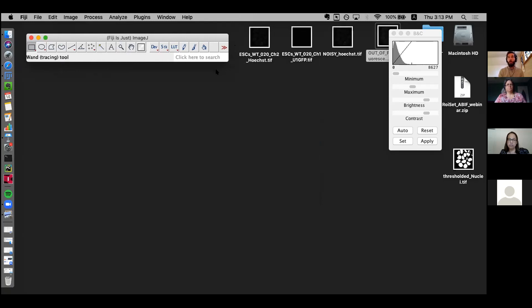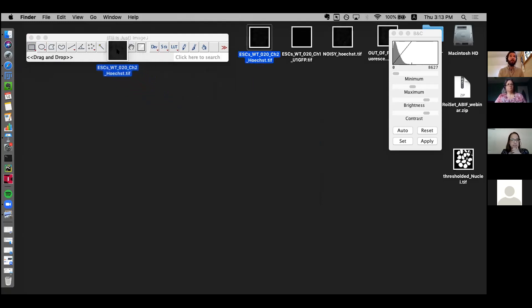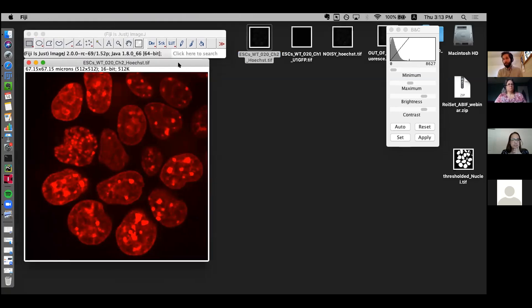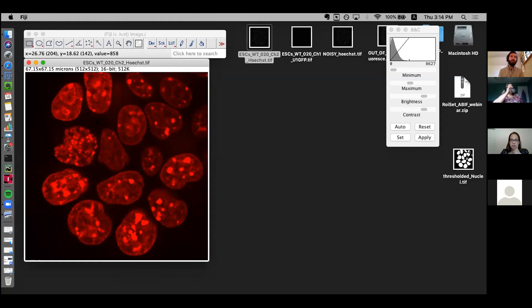We'll open one of our images — the Hoechst file, ending with 'hoechst.tiff', which is the DNA stain for the nuclei. You can just drag and drop it into the Fiji window. The image loads and you'll most likely see it in red, encoded in the metadata. However, this image was acquired on a simple monochrome camera, so the red is just for visual purposes since it was part of a multi-color image.